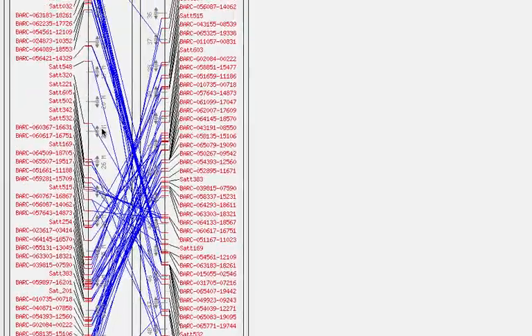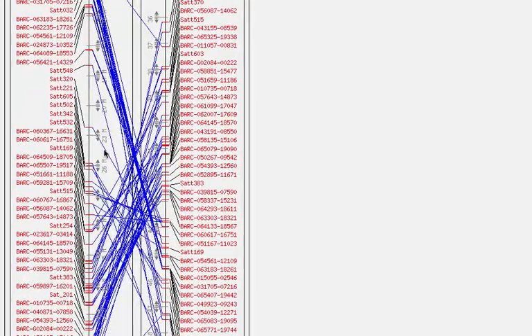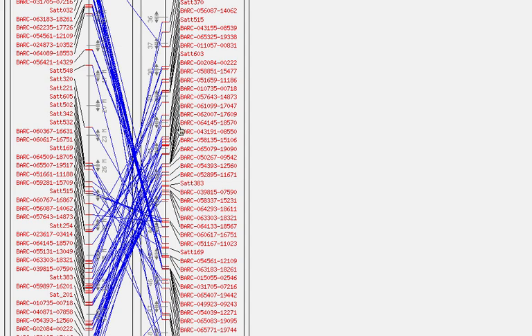What we're presented here is a little expanded version of that confused area, showing indeed there is either a physical map assembly difference or a genetic map assembly difference. Right at the moment, we don't know which.